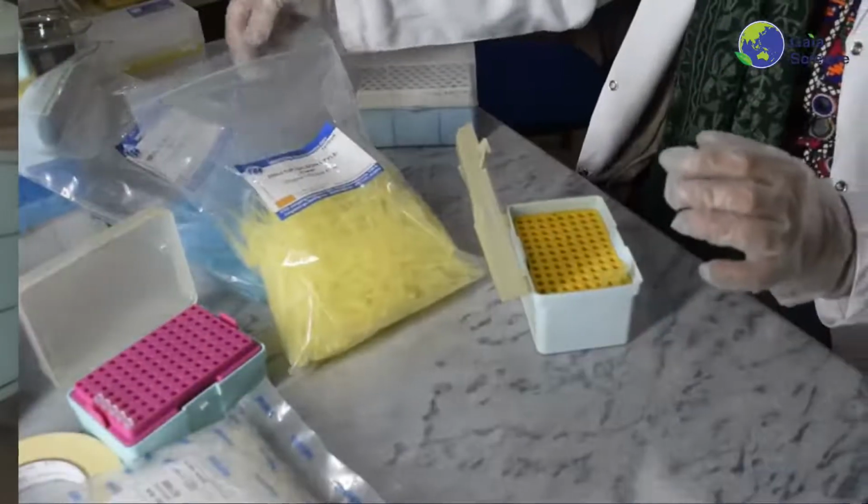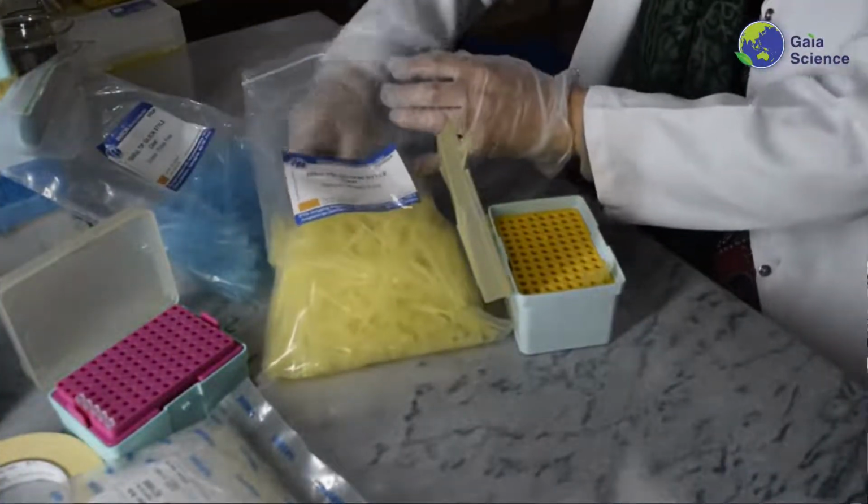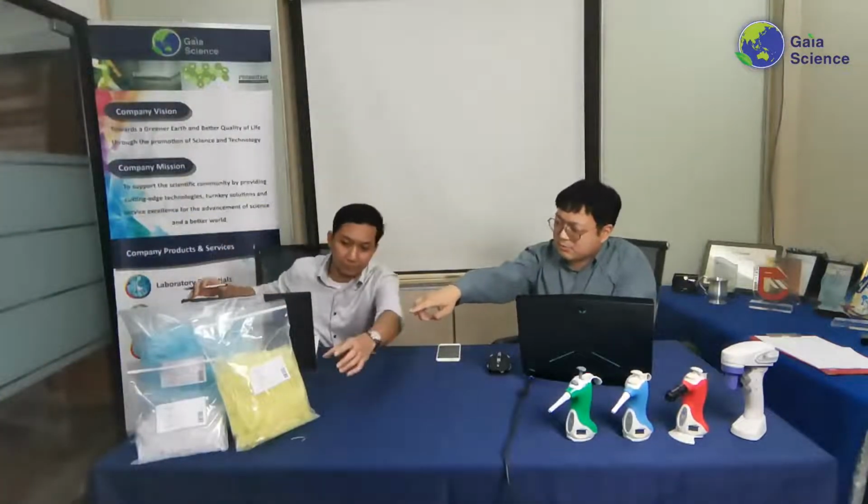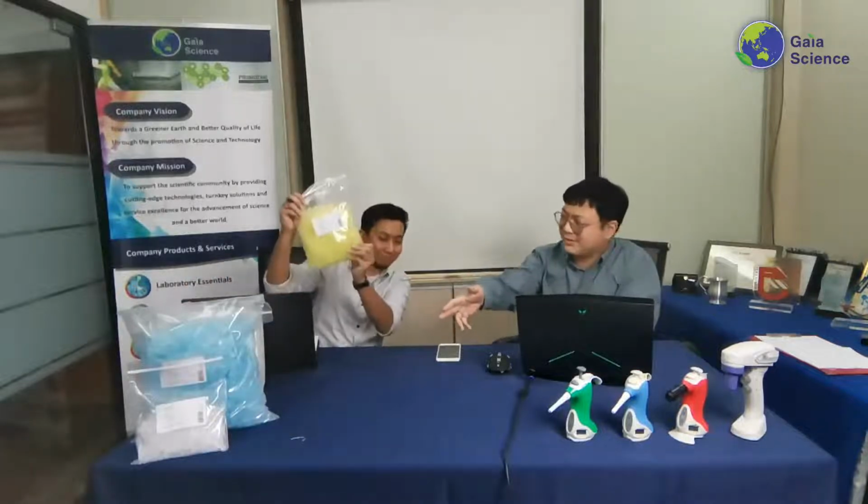As you said, the first question that a lot of people will have is bulk or rack. The analogy I would use is basically about what you're going to do with the tips. Are you looking at autoclaving them yourself? You have empty boxes in mind, and you're budget constrained in that sense? If you're really budget constrained, then you would tend to get bulk tips. If you can see, on the table right here, the bulk tips come in a few colors, of course.